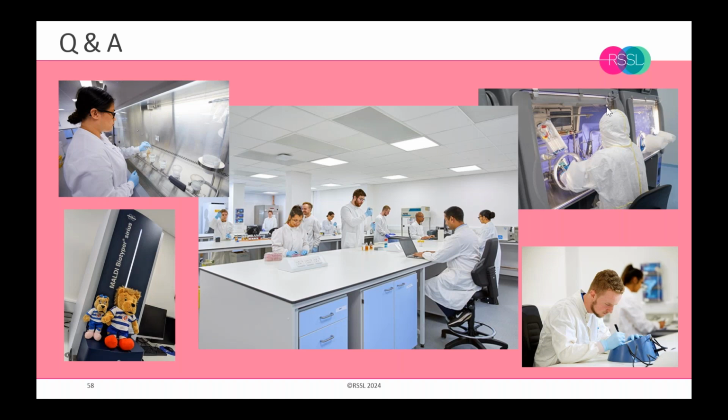And conversely, if you don't have the resources to always clean everything at a certain level, you can also increase monitoring to understand whether that is having a detrimental impact. So it is possible, but it is just one of many factors that needs to be considered.